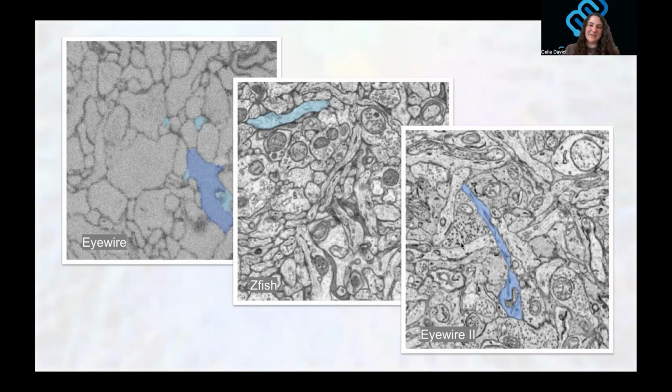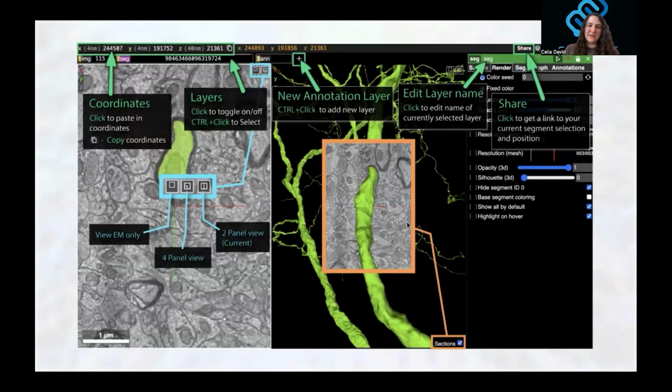All right. Okay, so here is the Eyewire 2 interface. We'll go over this a little more when I do a little introduction to the Cilia project. That will be the introductory project for you guys. But I just wanted to give an example of what you're going to be looking at. This image is also in some of our tutorial materials.